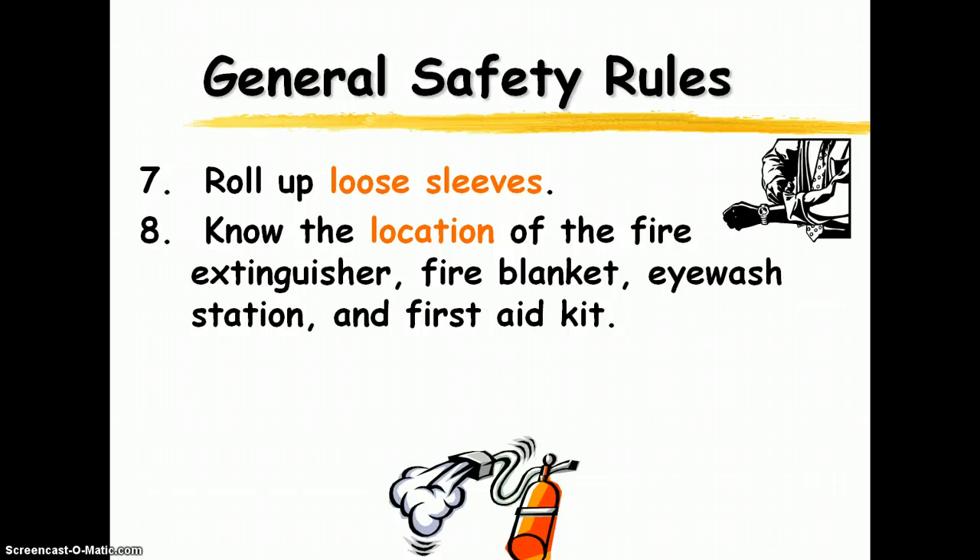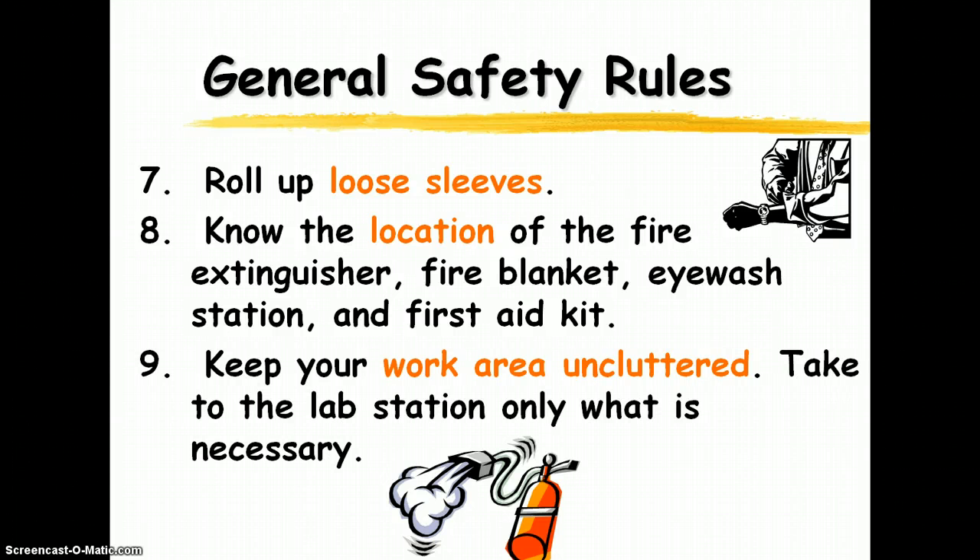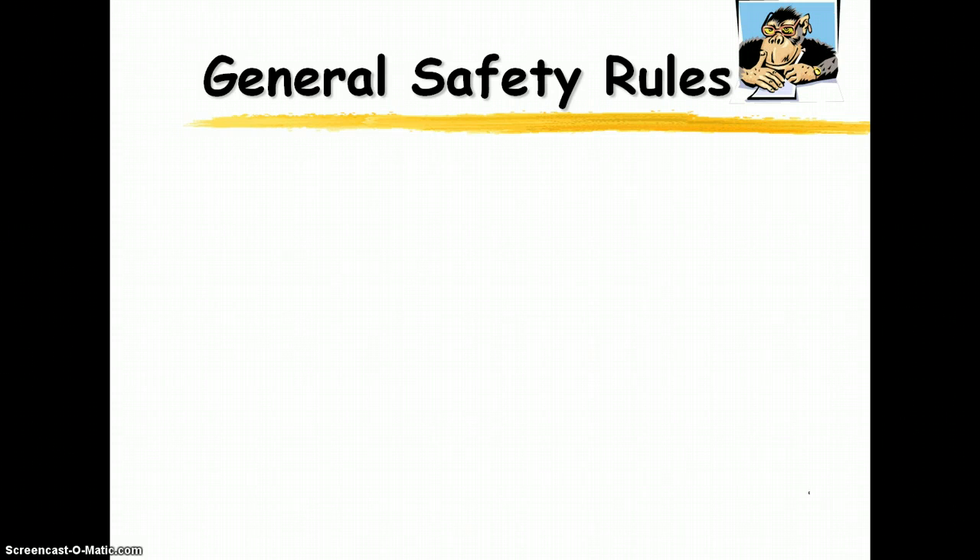The location of all the safety equipment — I'm going to show you that in class so that you know its location and how to operate it. Keep your work area uncluttered. Whatever's at the lab station is just what you need for the experiment. Your books and belongings you can place under the sink, and I'll show you where to put those. Keep it uncluttered — for one, your stuff can get damaged, and it's just way too hard to work with everyone's things all over the place.